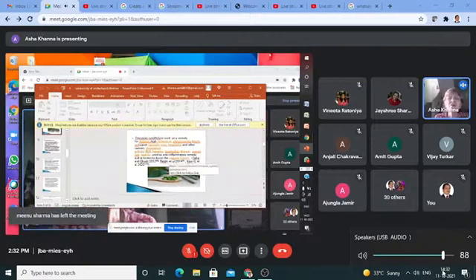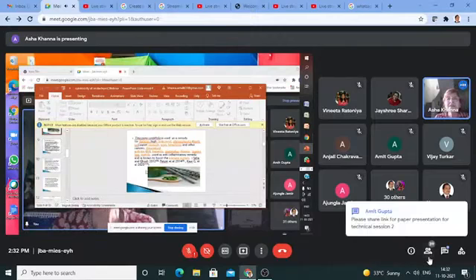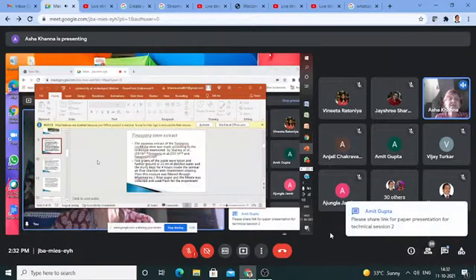बहुत सारा इनके इसके use बहुत जगह है. Okay, so that's why this was chosen and the stem was chosen. This is the stem. This is the stem. Okay. Now the aqueous extract was made.